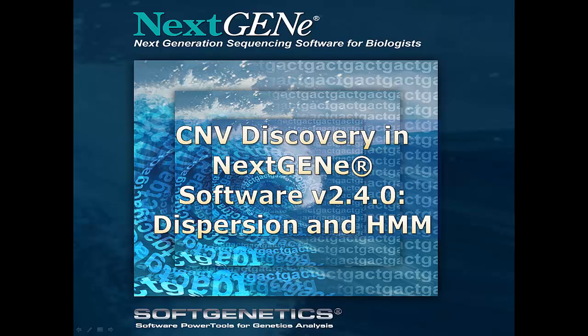I'm John McGuigan, and I'm a biologist here at Soft Genetics. And in this webinar today, I'm going to take you through the Dispersion and HMM Algorithm, which you can use for CNV discovery in NextGENe.